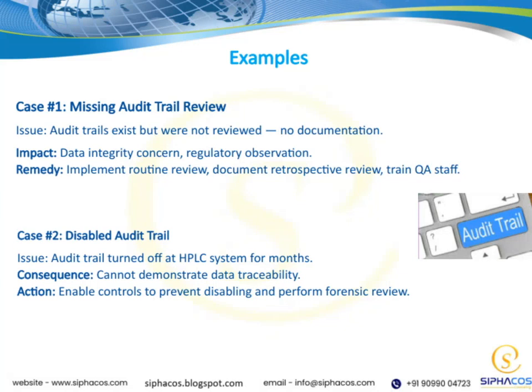Let's take a look at case number 2, which involves a disabled audit trail. The key issue here is that the audit trail was turned off at the HPLC system for several months.